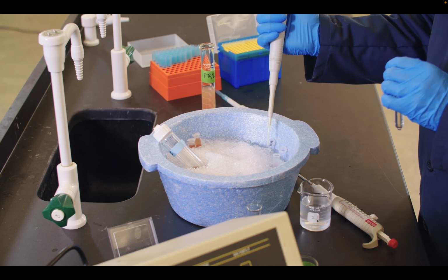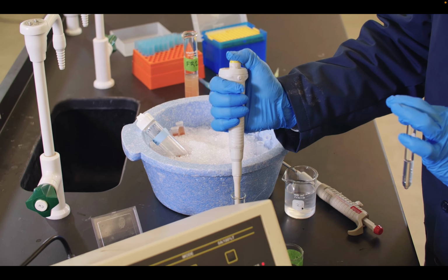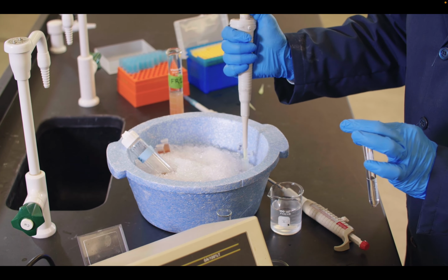Then we're going to add a couple of other components. We're going to add our secondary enzyme, which is the malic dehydrogenase. There's 100 microliters of that. So mix that in, change tips. All right, then I'm going to add the NADH, and remember that's the source of the spectrophotometer absorbance at 340 nanometers. And then we're going to add our GOT.